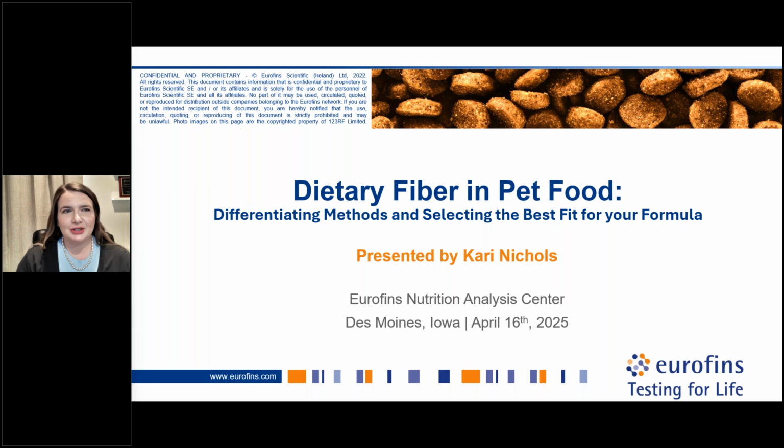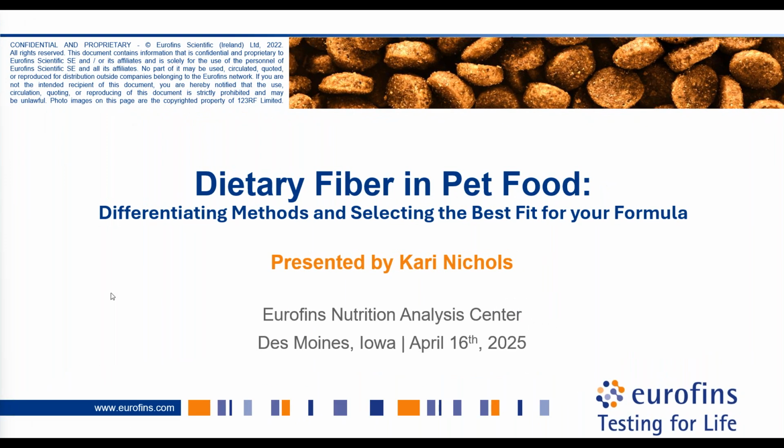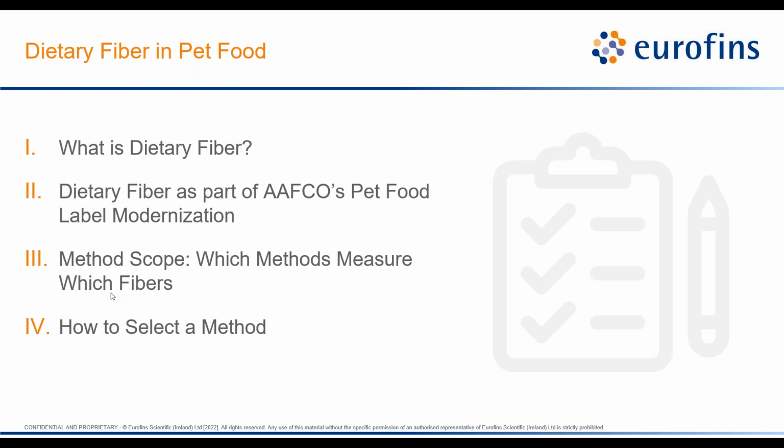So in order to make sure that we keep our bandwidth good, I'm going to go ahead and cut my camera here and move forward with our presentation on dietary fiber in pet food. Today I intend to cover a few things at a somewhat high level. We're going to start with what dietary fiber is. Then we'll talk about how dietary fiber has become an important topic of discussion in pet food through AAFCO's pet food label modernization, what each method quantifies, as well as, finally, considerations for selection of a dietary fiber method on finished products or ingredients.